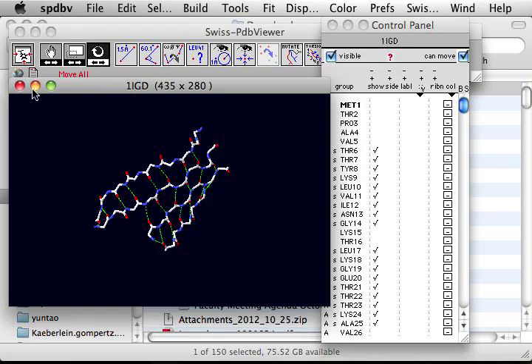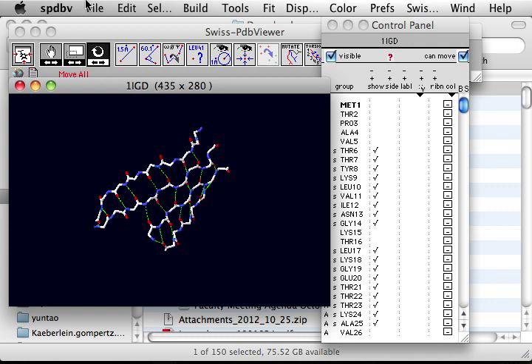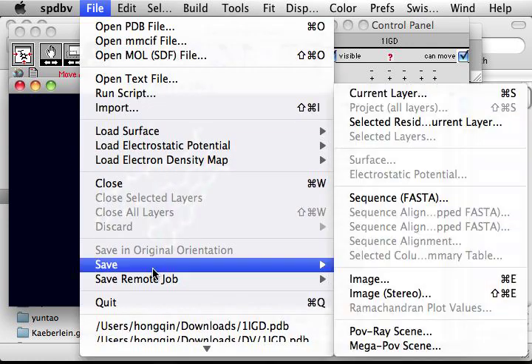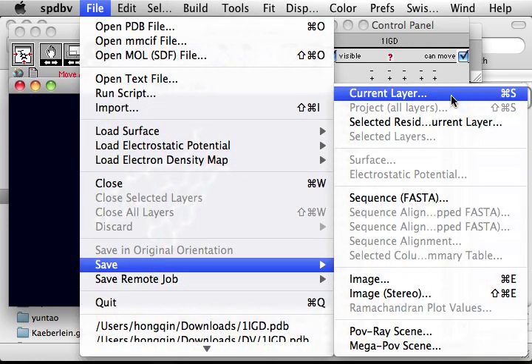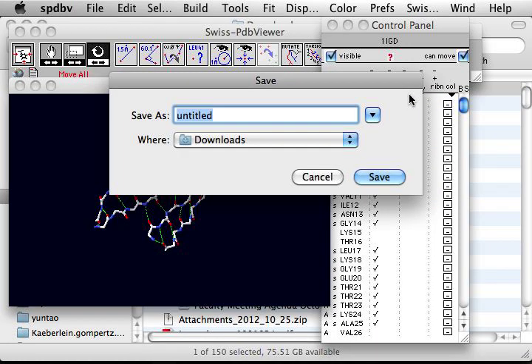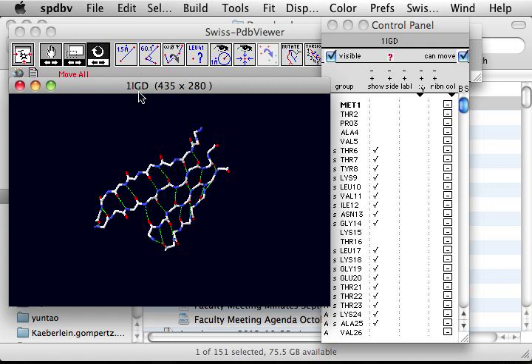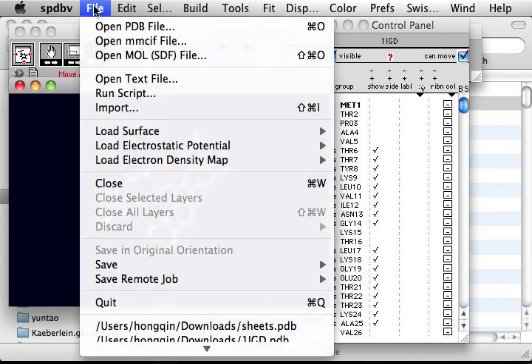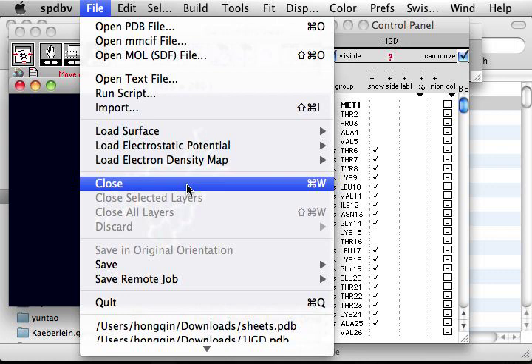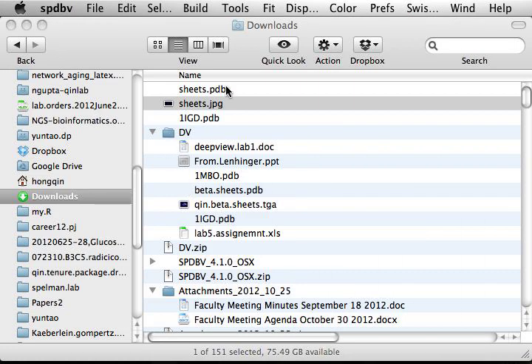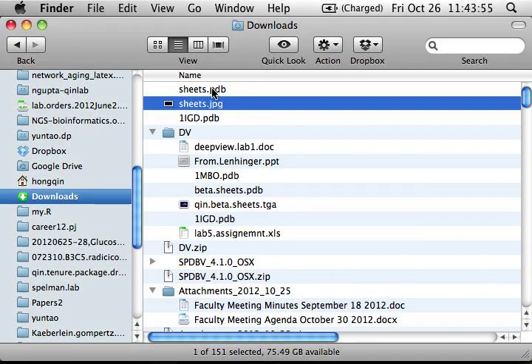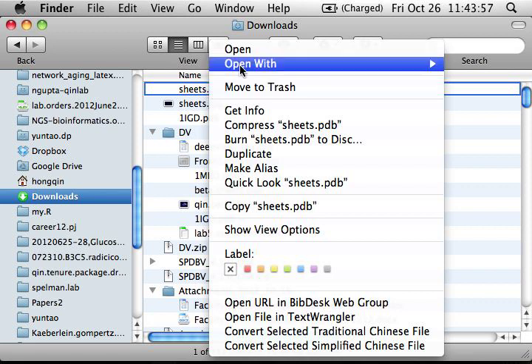But what if I want to save this working file? So next time when I use Swiss PDB viewer, I can still come to this beta sheet backbone with hydrogen bond there. This is something called save layer. So let's save the current layer. So we are going to call this sheets.pdb. Let's save this. And then we quit, close the current one. Close.